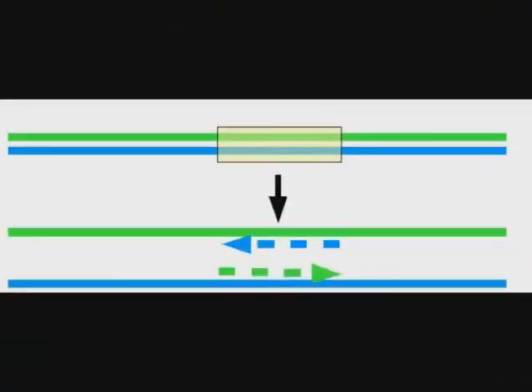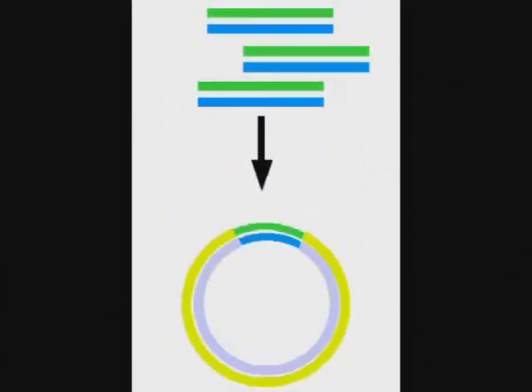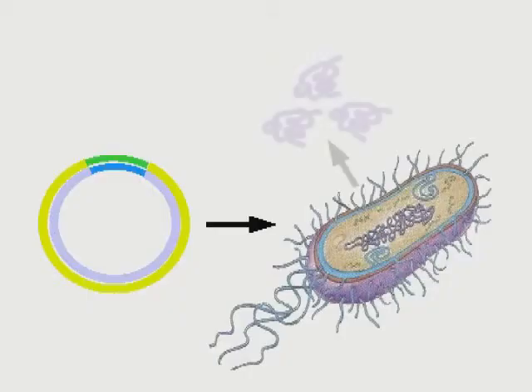An enzyme called DNA polymerase is used to create many identical DNA copies of the gene. The copies are then inserted into a circular bacterial chromosome called a plasmid. The plasmid, now carrying the cloned gene, is then itself inserted into bacteria to allow the expression of the gene. In doing this, we use the bacteria like microfactories to produce huge amounts of the macromolecule encoded by the gene.